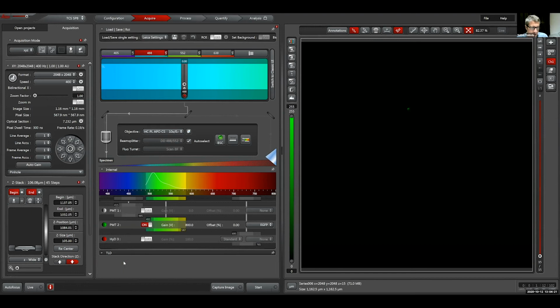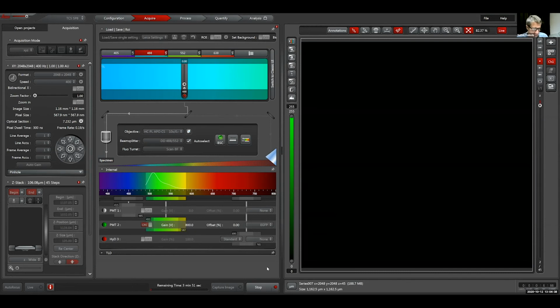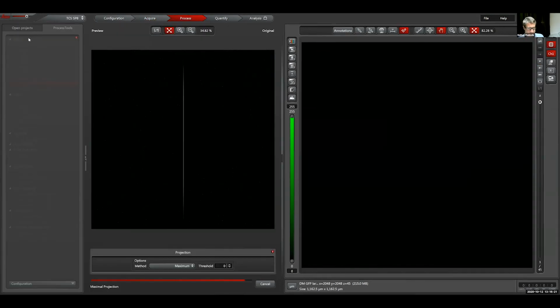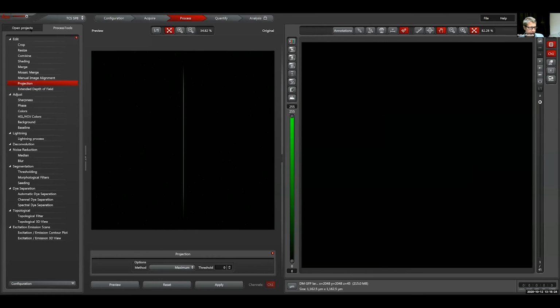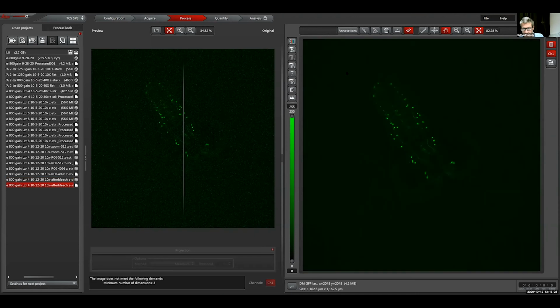If I do this, it'll do the whole brain. We did a triangle region of interest before. This time, I'm just going to take the whole brain since we're there. Probably 4 minutes or so? 3 minutes. Okay. And go back and take a look.